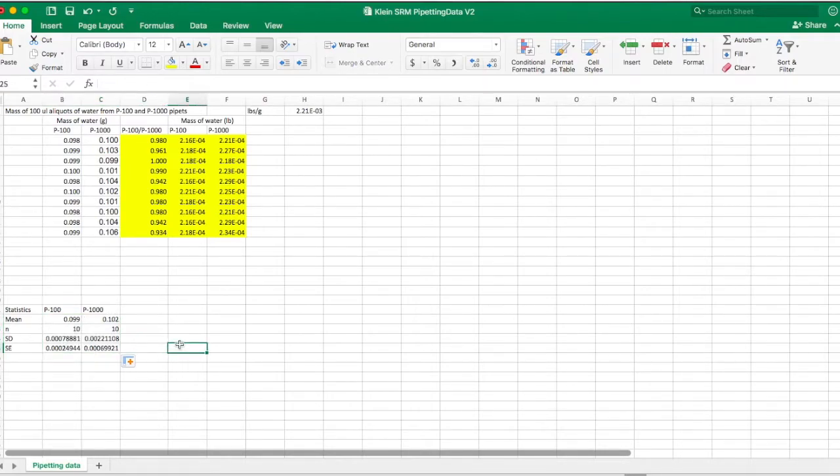In this case, we're going to leave N, or the sample size, as it is, and convert the other three statistics to 3 decimal places.